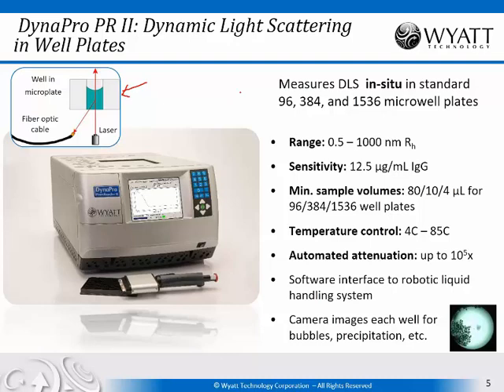And so the DynaPro measures dynamic light scattering in standard microwell plates. These are industry standard plates, 96, 384, even 1536 well plates, so that you can measure dozens to hundreds to even thousands of samples per day. The range of size that the instrument can measure is between 0.5 and 1,000 nanometers. And its sensitivity for IgG, for instance, is 12.5 micrograms per milliliter.